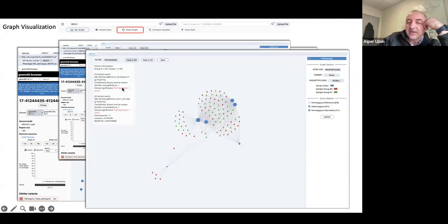So in the pathogenic variant, immediately from here you are going down to here because these are all pathogenic variants, and you can easily see what kind of groups, for example cases and controls, shared these pathogenic variants. And again, you can play around. There are so many other details, but I'm not going to go into the detail. You can play around with only heterozygous, only homozygous alternative, or highlighting the edges of these interactions. You can visualize that too.